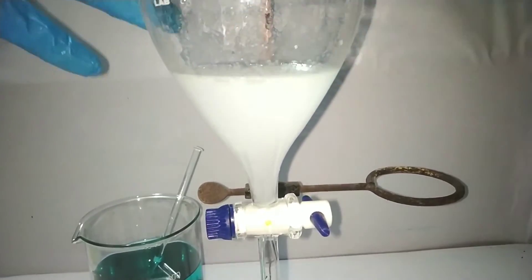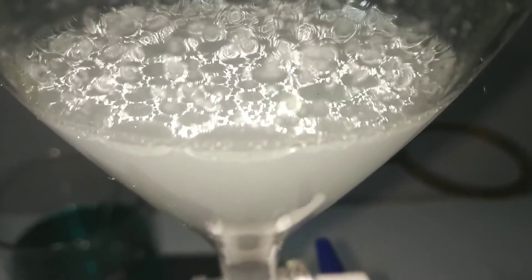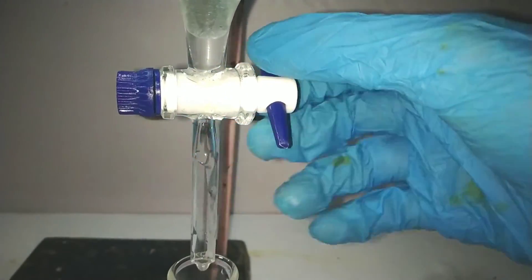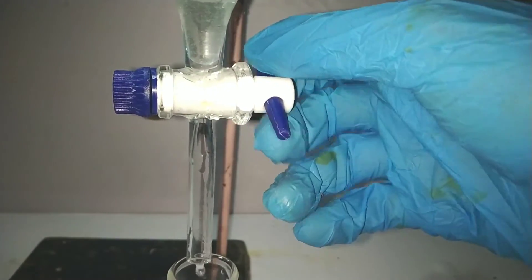After some time, we see that aniline starts to separate out as an oily layer on the top. Now we can take the lower aqueous layer and discard that, and the upper layer, that is the aniline.